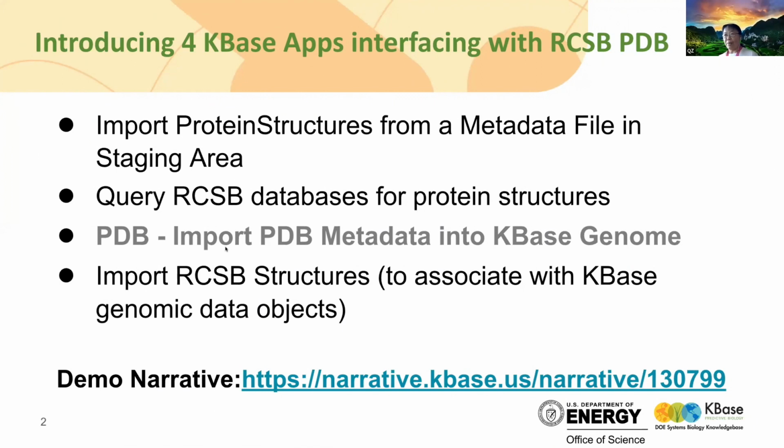The third app is PDB import metadata into a whole KBase genome. This one I'm going to just put in here because it's in a bunch of our apps, but Chris will dive much more deeply into it.